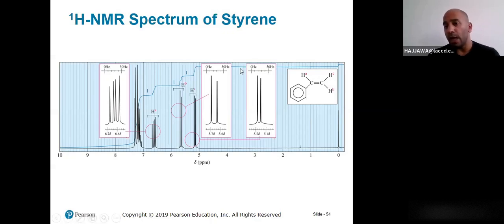Well, HC is cis to HA, while HB is trans to HA. I would expect that to reflect on the peak, even though the environment is almost the same. So you could look at the 2 peaks closer. I have a narrower doublet versus a wider doublet. The wider doublet reflects the trans, the narrower one reflects the cis.